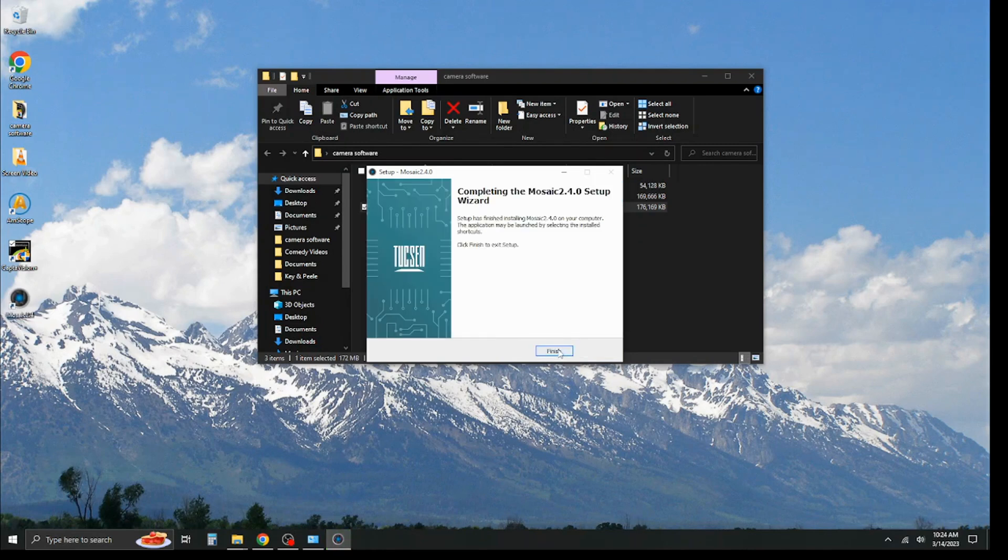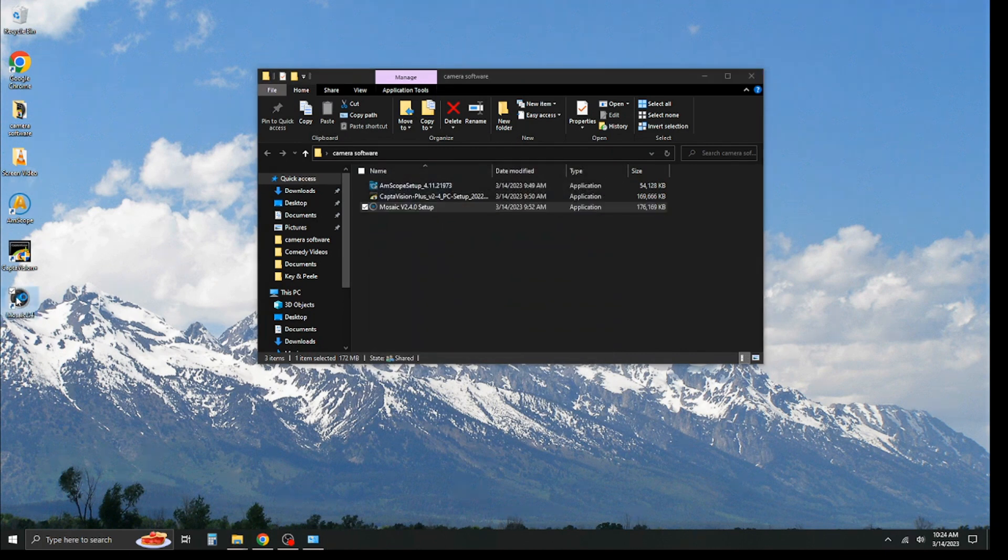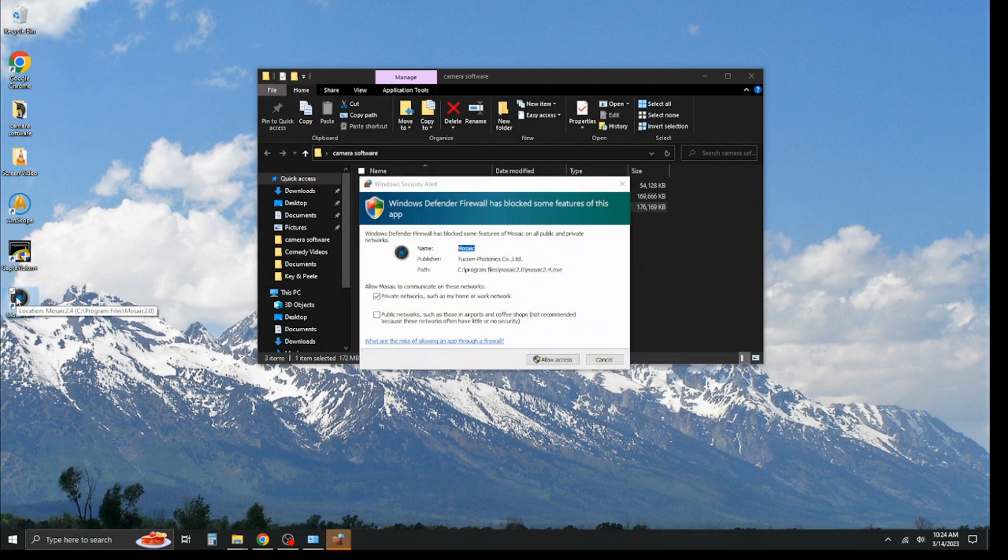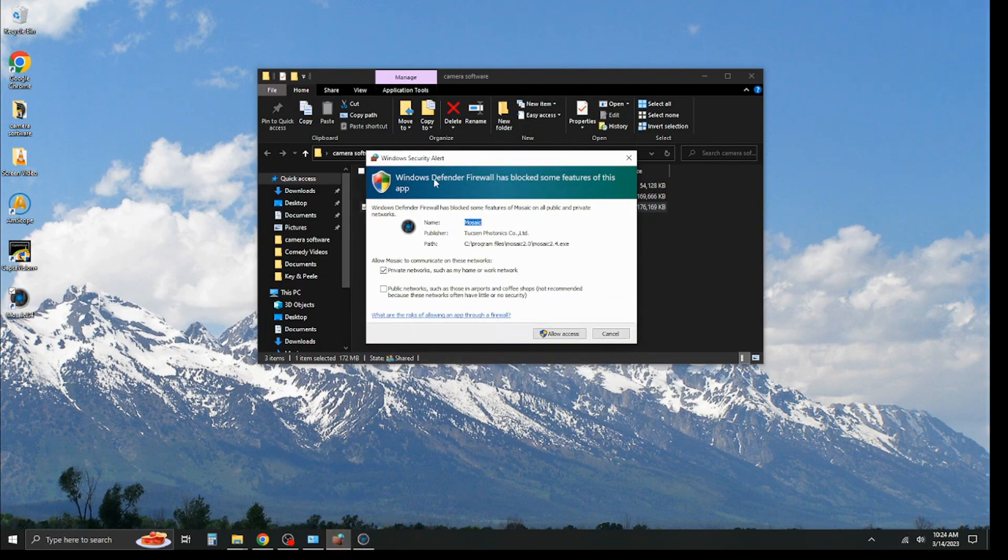And we hit finish, and we see that our software has been installed. We go ahead and double-click this to launch. It's going to take a couple of seconds. And now, you see, you do get a security alert. That's because it's going to block some features.